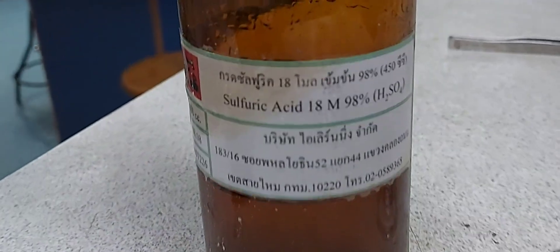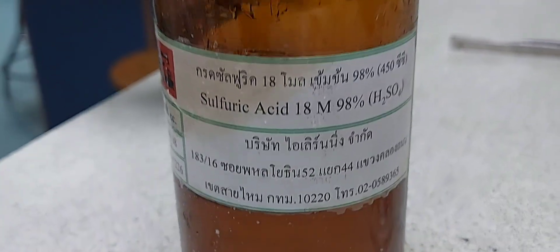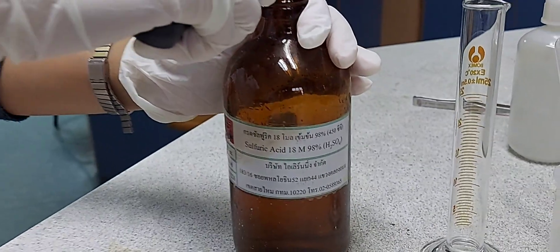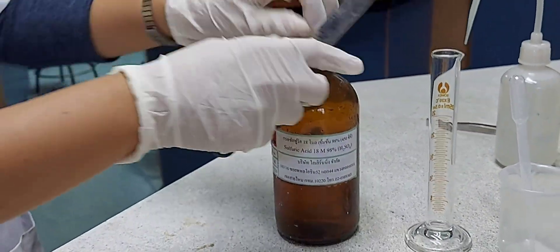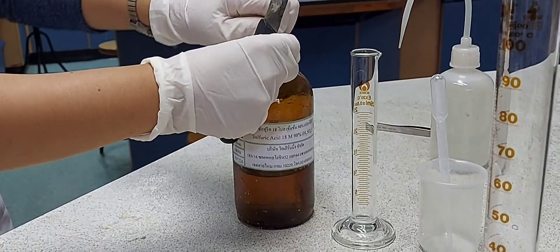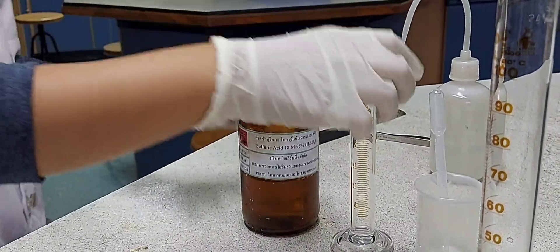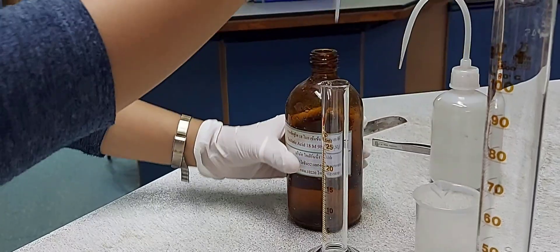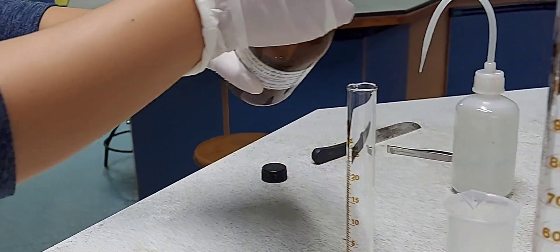Hello everyone, here in this experiment I am going to show you how to go about diluting concentrated sulfuric acid. I'm taking 18 molar concentrated acid and diluting it to 1.5 molar.